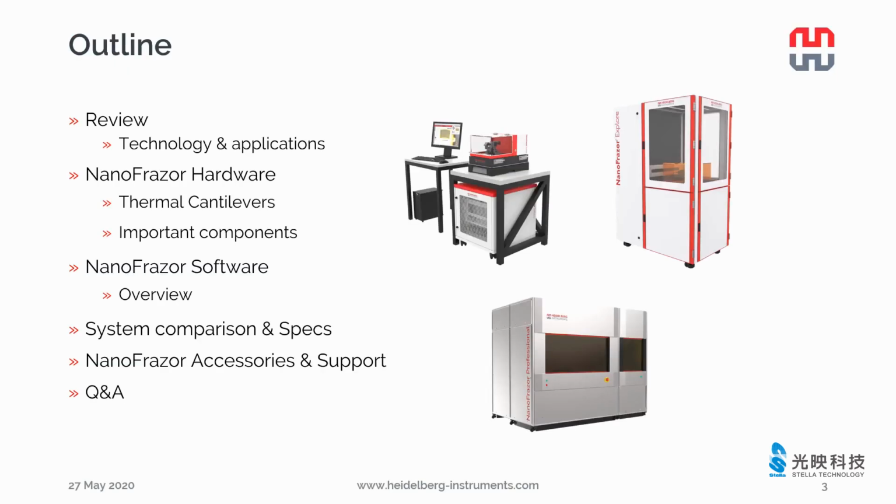In this webinar, I would like to review quickly the technology and applications of the NanoFrazor, explain to you the important components of the hardware, show you the NanoFrazor software, then compare the different systems of the NanoFrazor. At the end, I will also introduce some useful accessories.